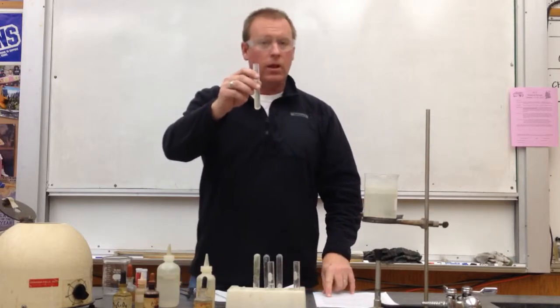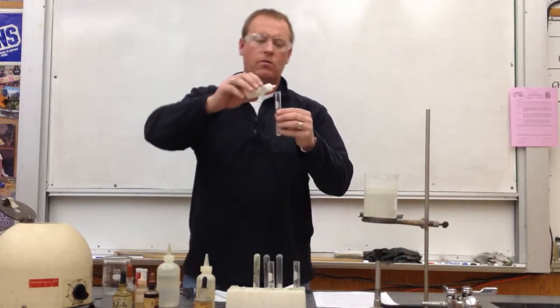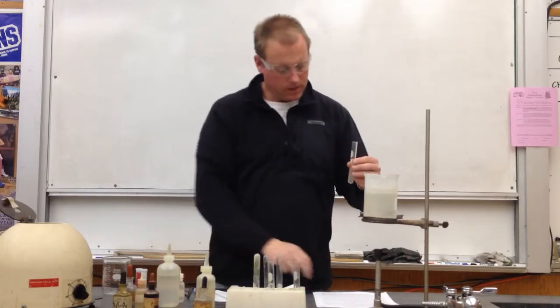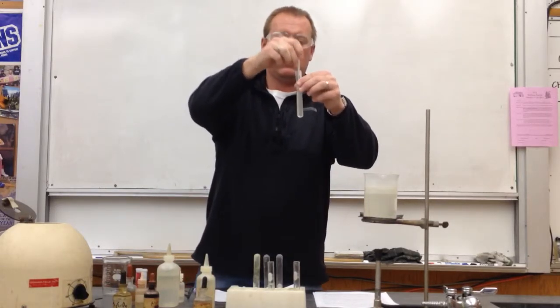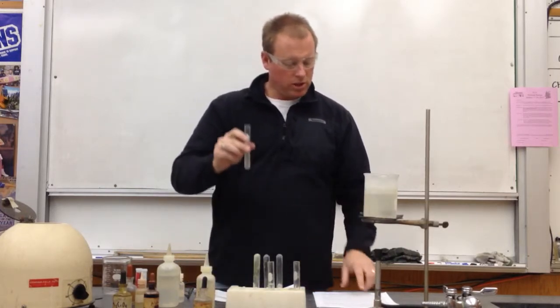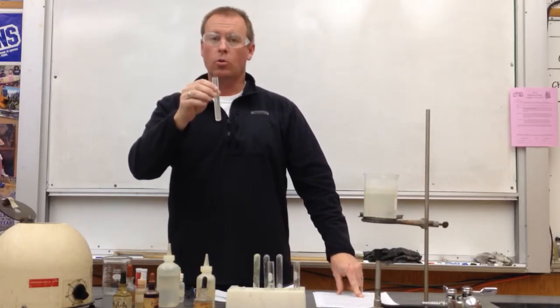We're going to add 1 milliliter of ammonium chloride, so a little less than 1 finger's width of ammonium chloride. And we're going to stir. And then, as we continue on, we're going to make the solution just barely basic using ammonia water again.